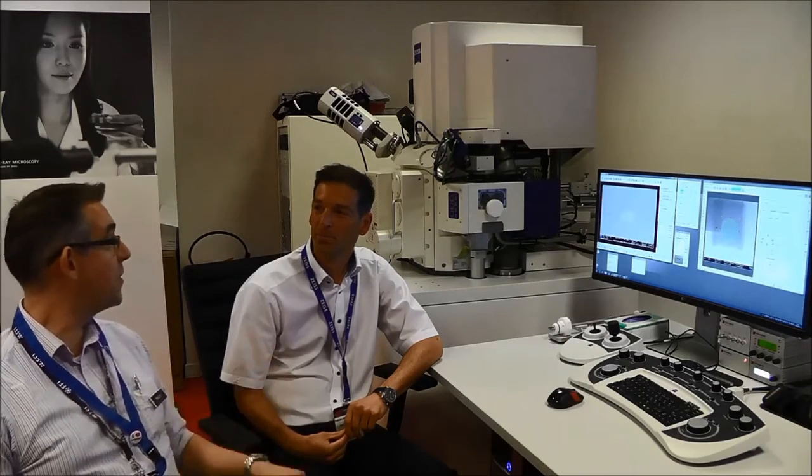I'm here today at EMC 2016 with Dr. Fabian Perez-Willard, and we're exploring what Zeiss is currently able to offer in terms of FIB-SEM dual beam technology. I believe you're just going to give us an update to your very popular CrossBeam system.